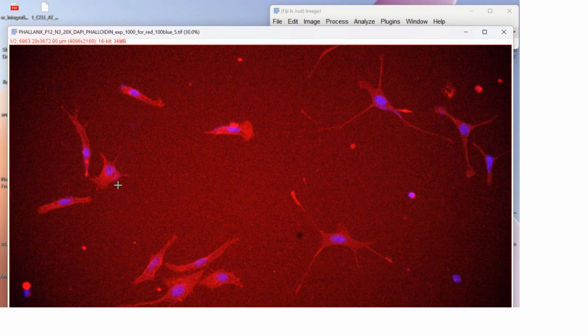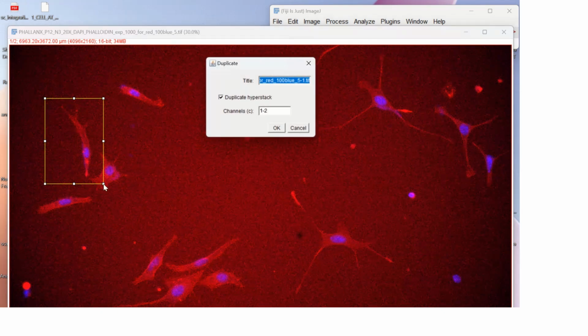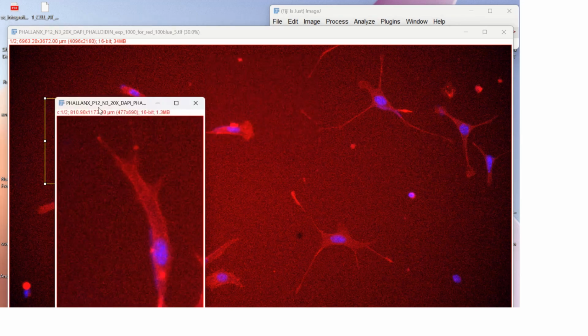And basically what we want to do is we want to capture one cell at a time. So if there's a part of another cell, that's fine, but there should not be two cells in there. It should only be one full cell. So Control Shift D to duplicate. It's asking me about the name. The name's perfect. I press OK.